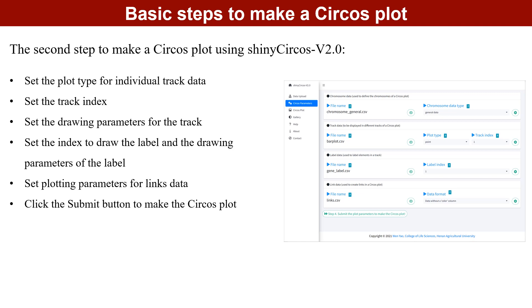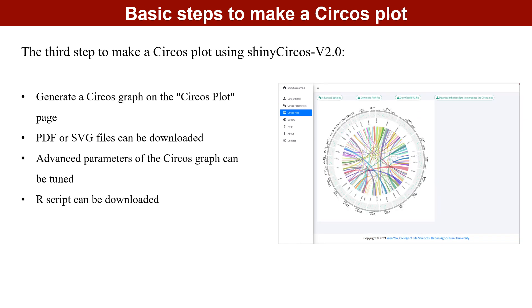The second step to make a Circos graph using ShinyCircos v2.0 is to set the parameters of each input data, such as the data type of chromosome data, the drawing type of track data, the drawing index of label data, etc. Then click the button to make the Circos plot using the current dataset and draw parameters.